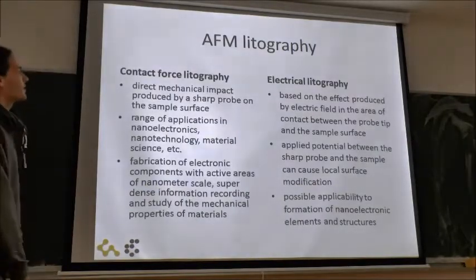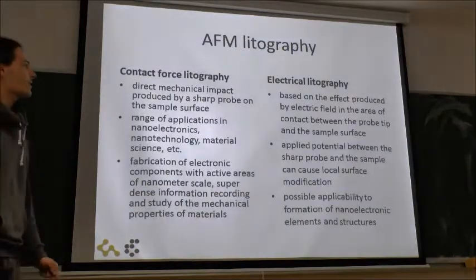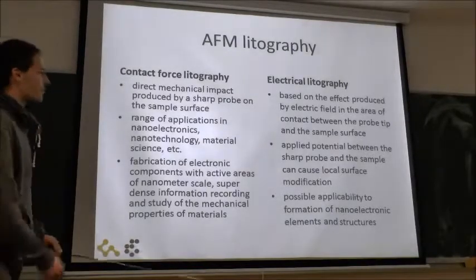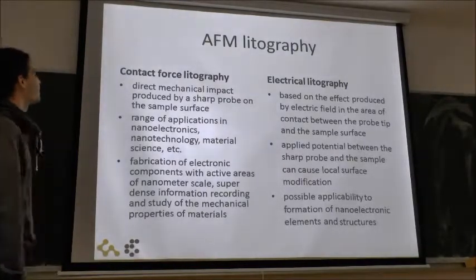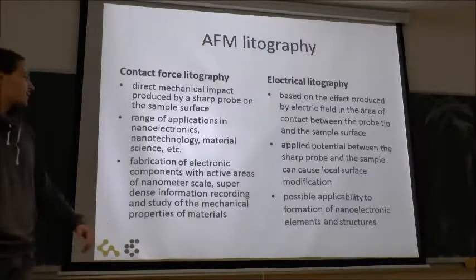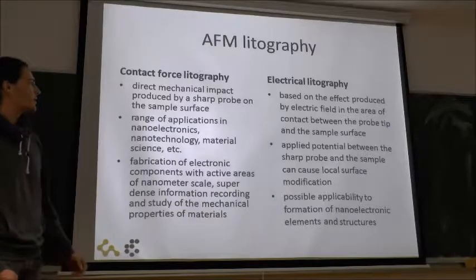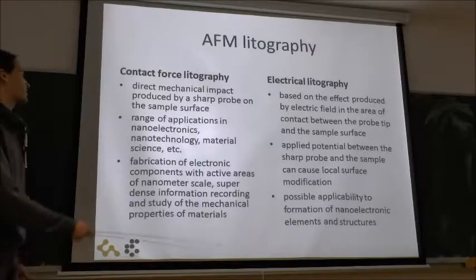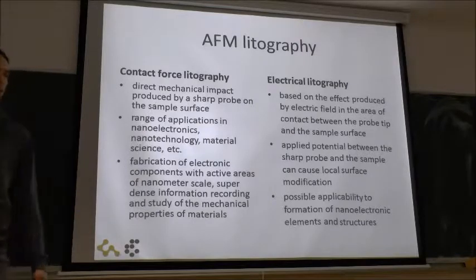What else can we do is the AFM lithography. These things are maybe not so important, so I will just briefly tell that we have a contact force lithography where with the probe we are scratching the surface, and it has some applications in nanoelectronics and nanotechnology.